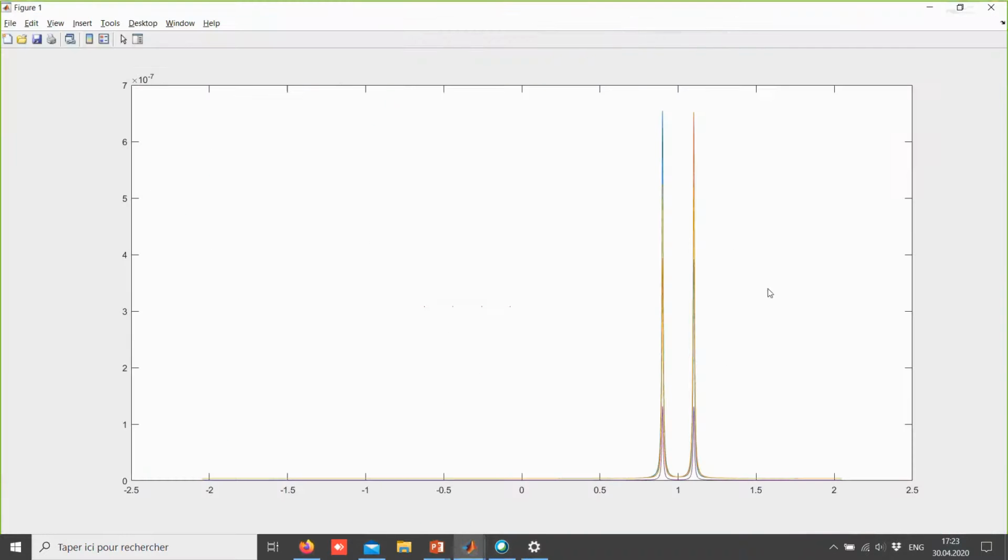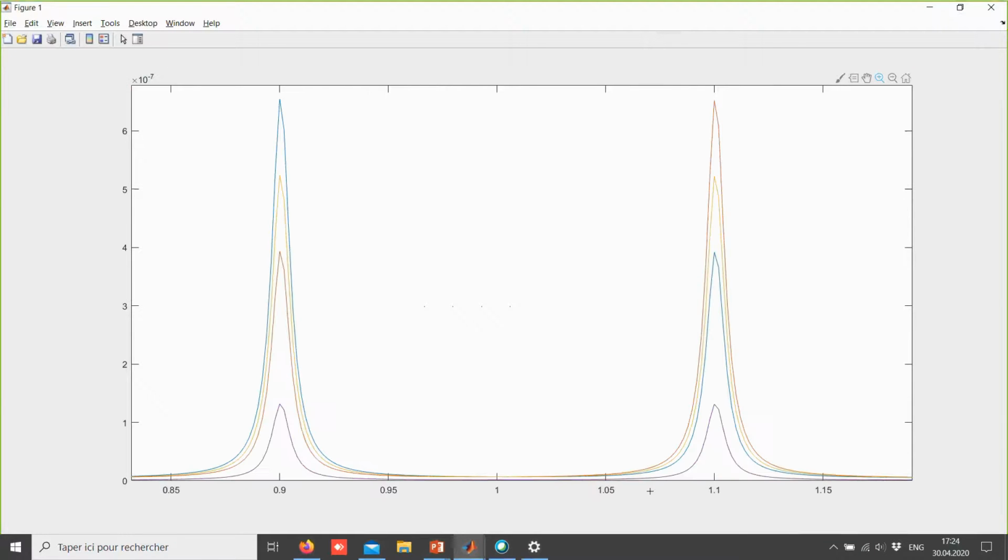And this way you can really see the effect of the INEPT. We started with an intensity. Maybe I'm going to normalize. This will be interesting to show you how to do this also. I'm going to normalize the spectra by the intensity of this one, so that we see that we should have a 0.25 here if there's 1 here.